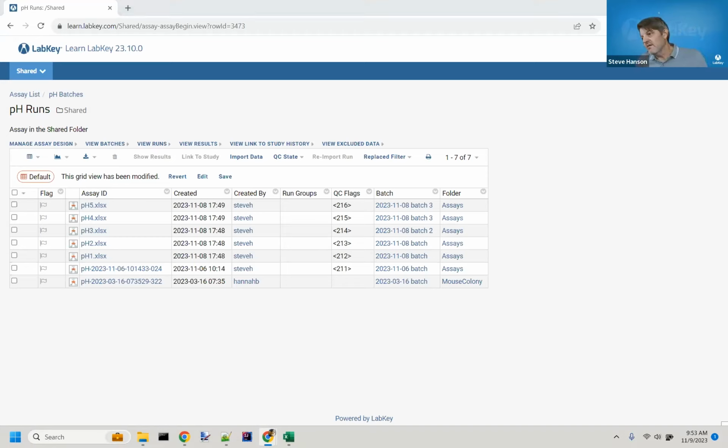Got some Q&A. Let's see what we got here. Someone asks, I notice you don't use spaces in a lot of your fields. Are spaces accepted, or do you have to format names that don't have spaces in them? That's a great question. It's in fact true, I tend to avoid spaces. Honestly, they are allowed, but I think it tends to make things ugly in LabKey. If you use spaces in fields, and you plan on doing SQL queries later, it makes the SQL queries ugly. I just don't like to do it that way. You can always make the label have a space in it, so I prefer to avoid spaces and then introduce them as labels.